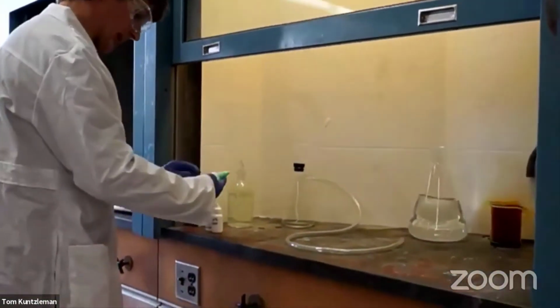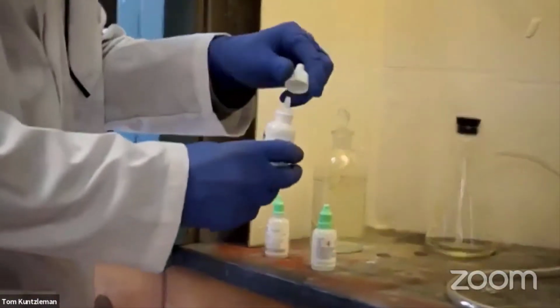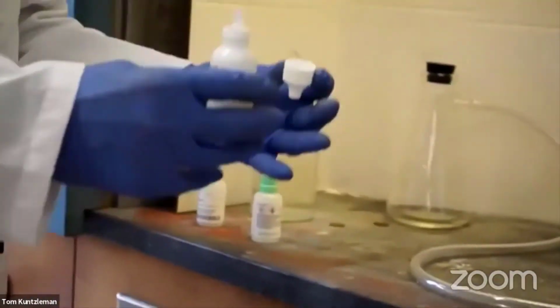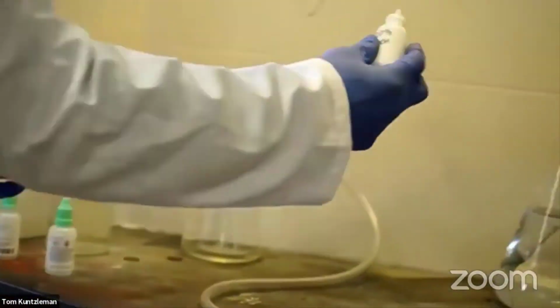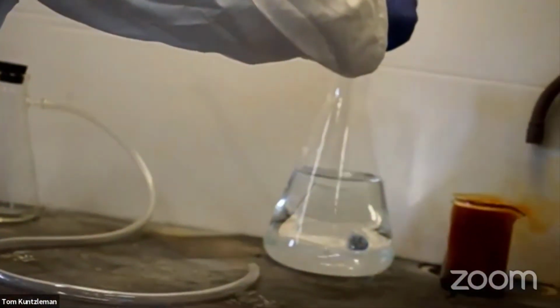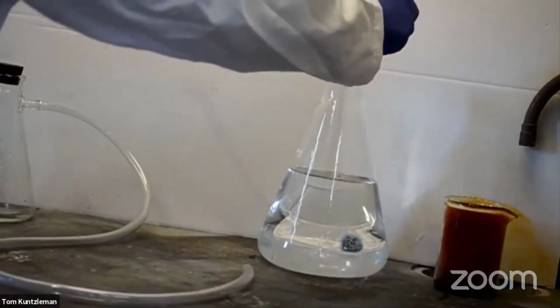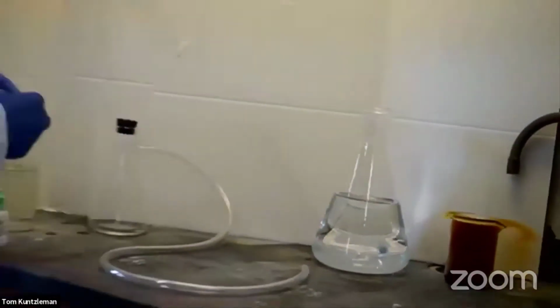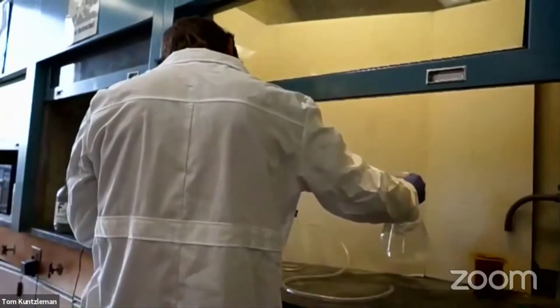What I'm going to do is add a little bit of base. Base is a type of chemical that reacts with acids. Acids and bases react and they neutralize each other. So I'm going to put in a few drops of this base. I'm not sure this is going to work, by the way. I was trying to get it to work this morning. It wasn't working, so we'll see.